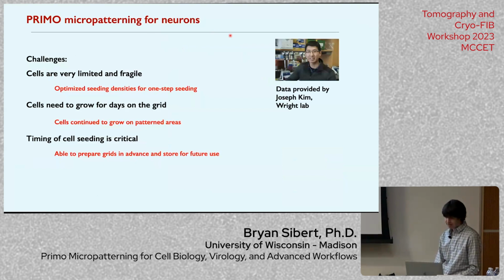And so finally, I'm going to show some work by Joseph Kim in the lab on neurons. He wanted to look at primary Drosophila neurons, and there are a lot of challenges, and we weren't sure that micropatterning was going to work. And he spent a lot of time and got it to work quite well.